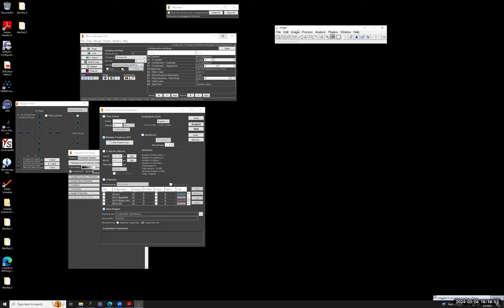But now, of course, there's more similarity between Micromanager and ImageJ in the sense that they are both open source software, community driven, and it means that in both cases you have some core functionalities, plus they can be extended by plugins and scripts developed by the community, by different users. So that is also the case of Micromanager.